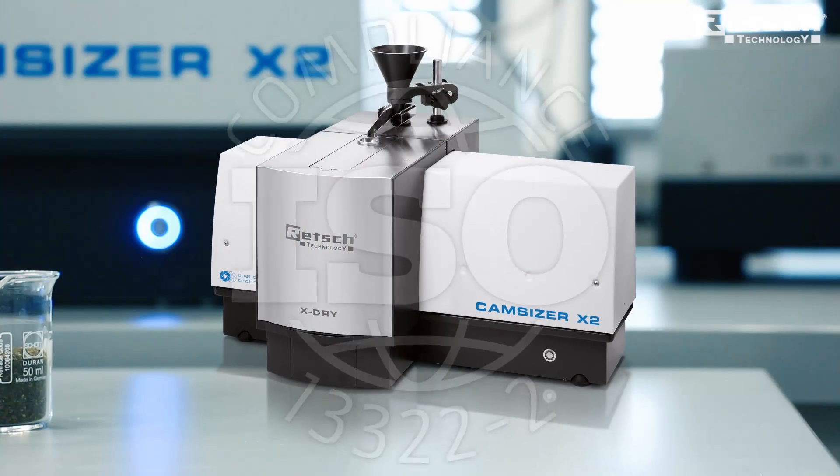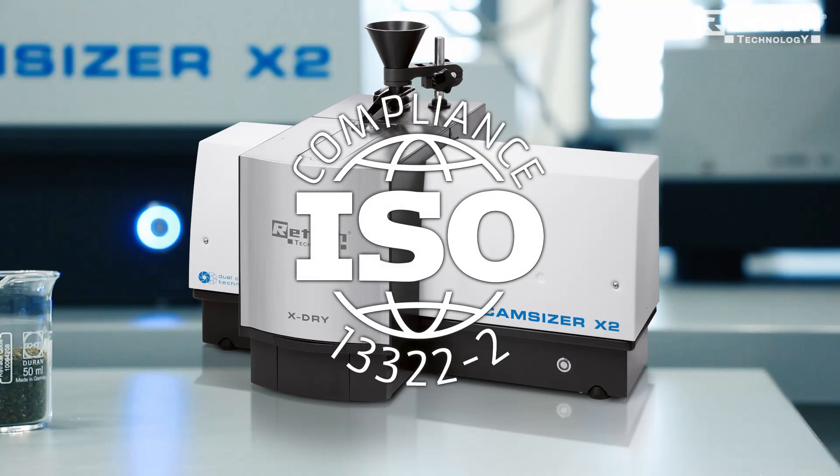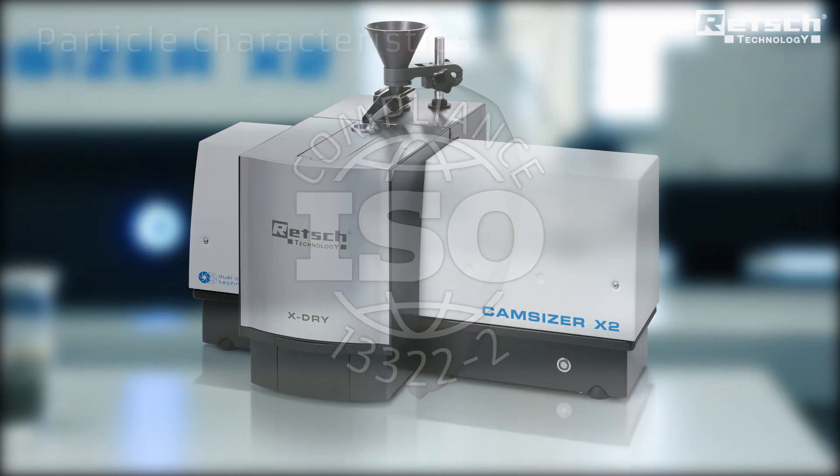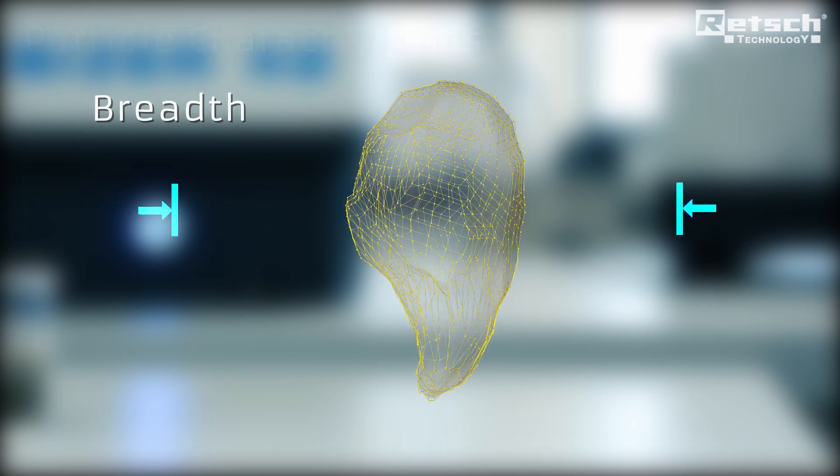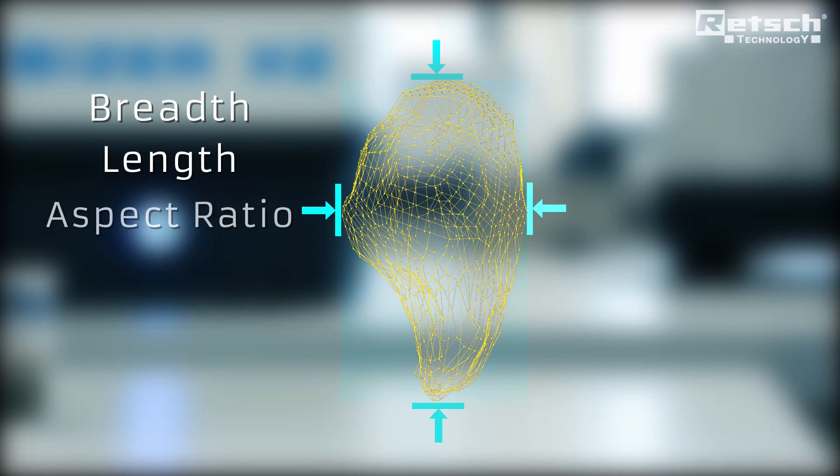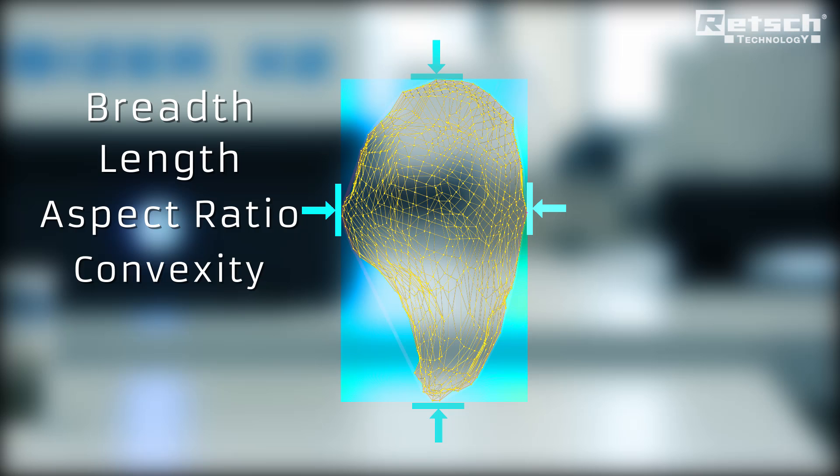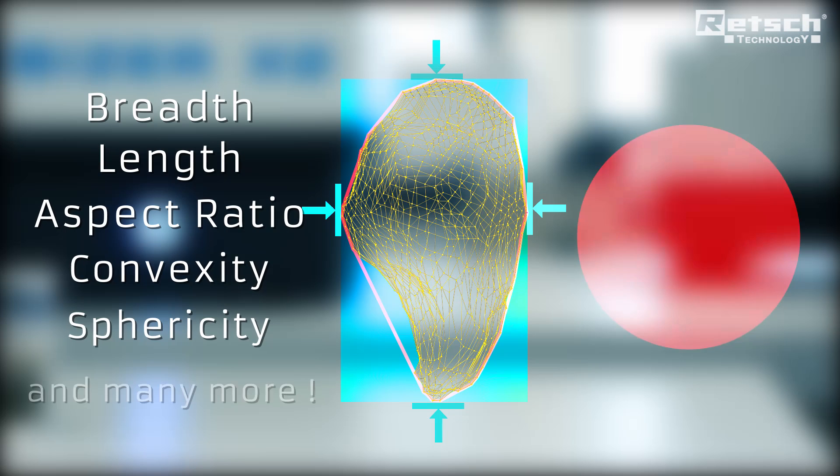The CamSizer X2 operates in compliance with the ISO standard 13322-2 and provides detailed information on different particle characteristics such as breadth, length, aspect ratio, convexity, sphericity and many more.